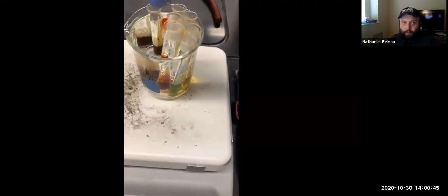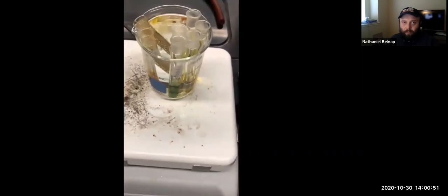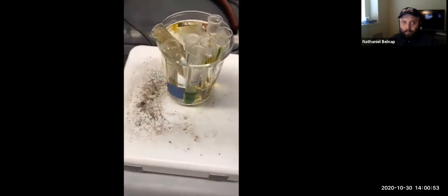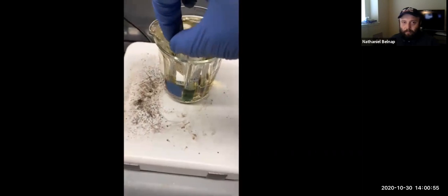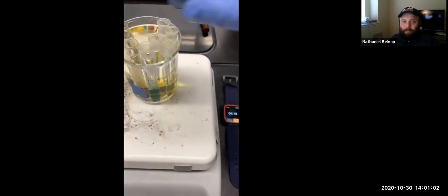So some are yellow, some are dark orange. Let's turn in my, oh. He should have like some clamp or something to pick those up, but not with your hands. My inner safety supervisor makes me want to scream out of this video right now.